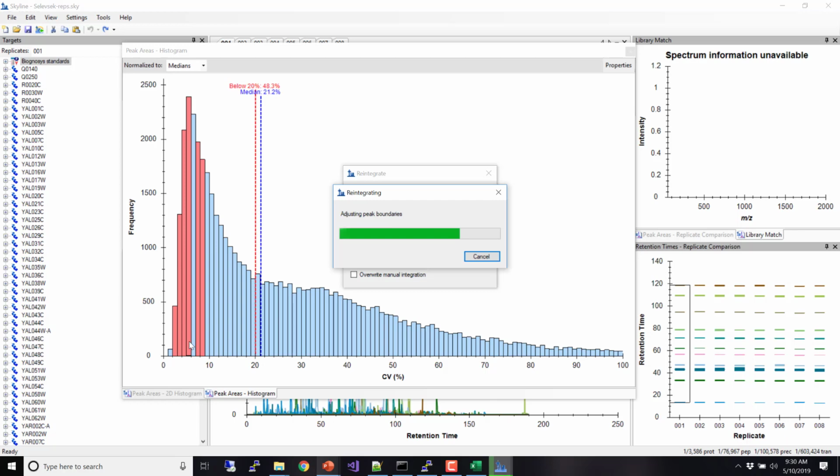that this takes about 20 minutes. The processing of this replicate experiment takes about 20 minutes, and then processing the full data set, which is around 20 runs, 24 runs maybe. No, that's the other one. I don't know. 18 runs. That takes 40 minutes.